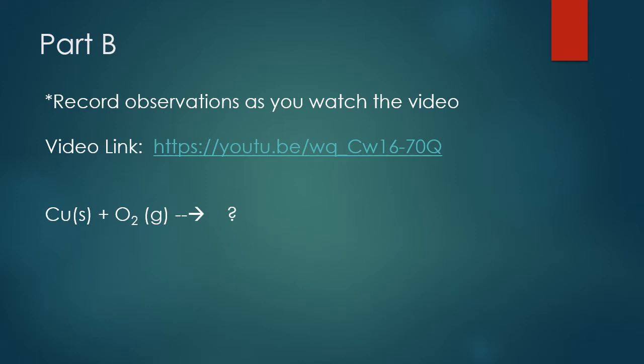Part B, you're taking elemental copper and reacting it with oxygen. We do this by introducing flame, so watch the video and record your observations. There is a question that says, in the previous lab, a crucible cover was used. Why was one not used in this experiment? Well, we're not doing these labs in order, so that's going to be a difficult question to answer. So you can go ahead and skip that one. If you choose to answer it, that's fine, but I won't count it incorrect if you have the incorrect answer there or if you leave it blank.